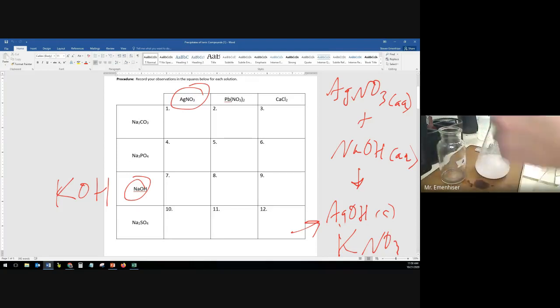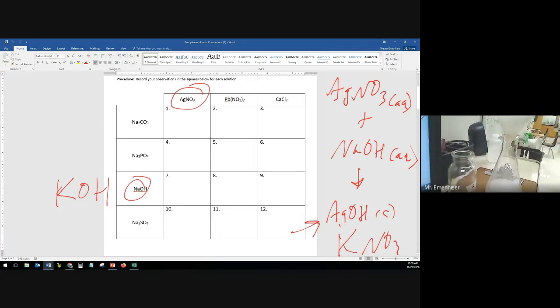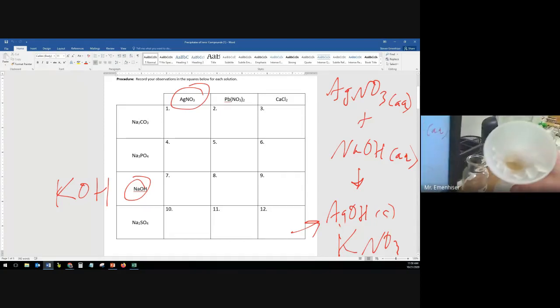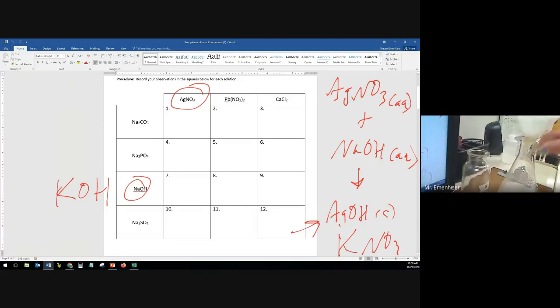And y'all can't see that brown color in there. I wish I could get the shot in the filter. Maybe if I pick up my camera. Let's pick up my camera and see. So you can see the brown color in there. And I'm using the camera that I have on my desk because I need the iPad to write the notes, because I want you guys to be able to see this in real life and then connect it to the chemistry.